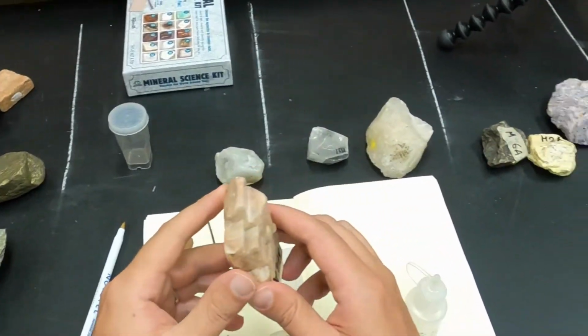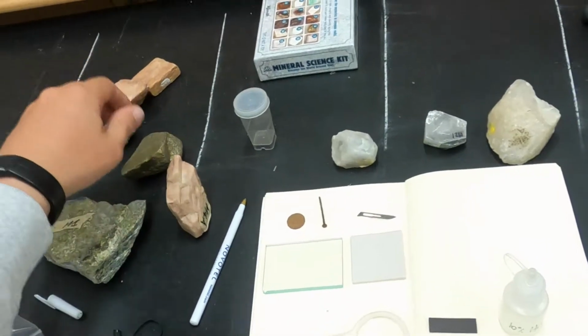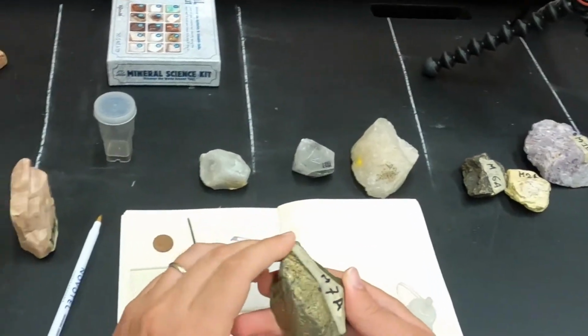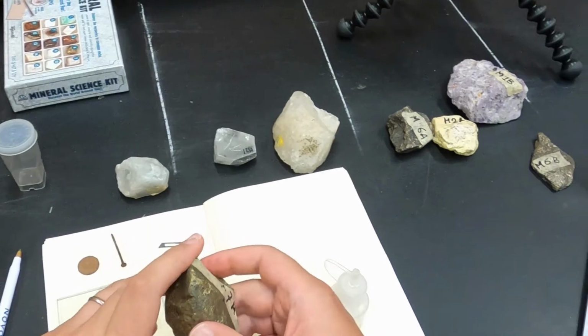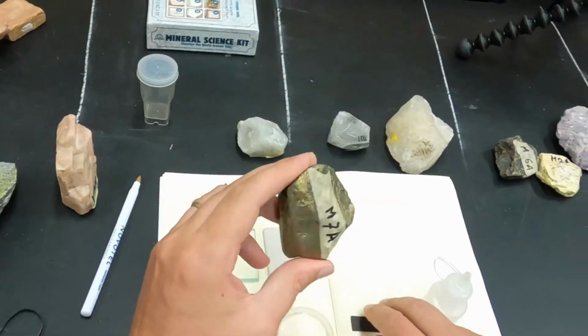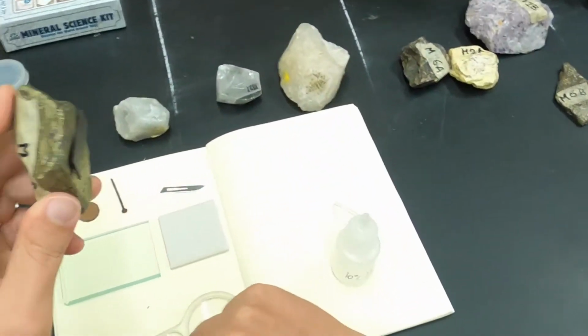Other things, yes, the magnet. So many times we will find minerals that are not very transparent. They look dull or sometimes metallic, like this example here. Well, these are sulfides and also oxides, and it happens to be that you can test for magnetic properties like this.